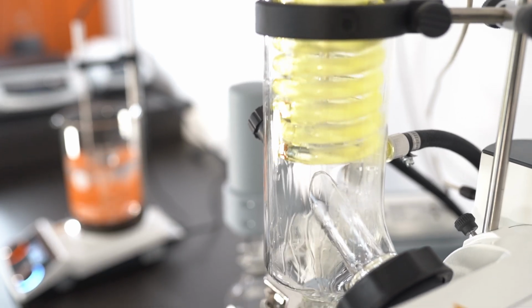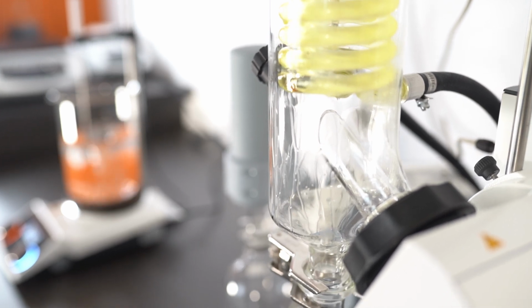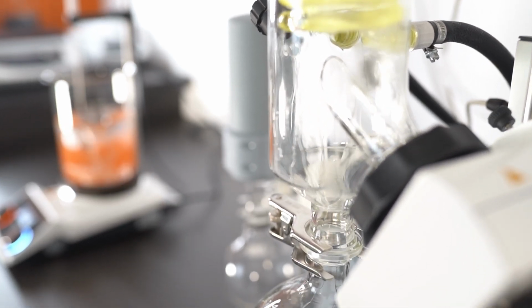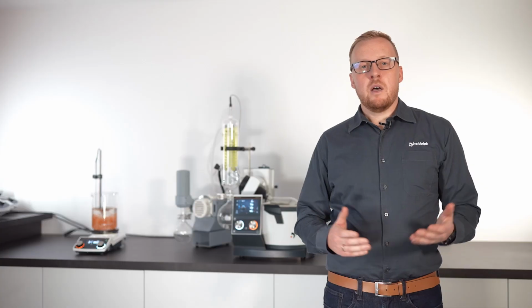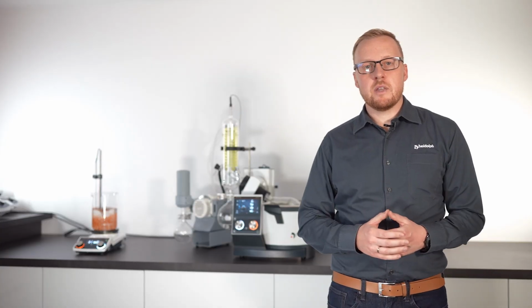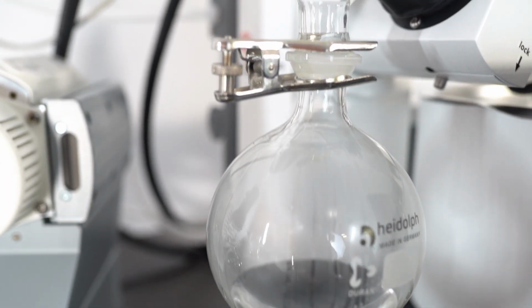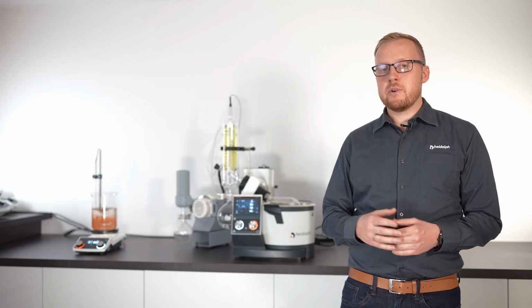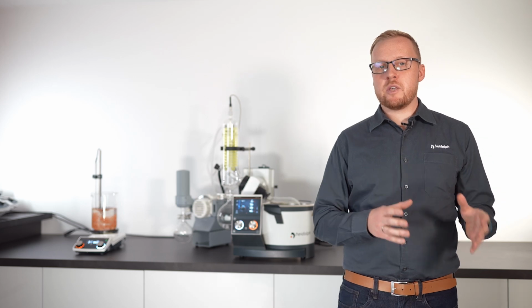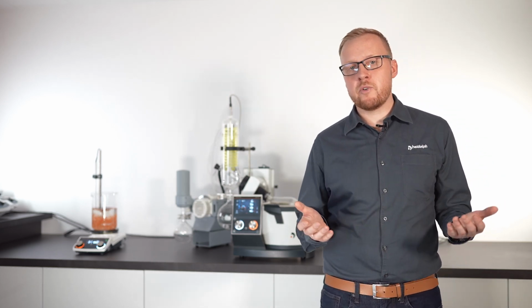As soon as the first rising vapor increases the temperature at our point of measurement, the system reacts and will keep the vacuum level, and with it the vapor load on our condenser, constant. After a while of constant evaporation, the residue level of our focus solvent decreases, and with it the created and rising amount of vapor. In a manual process, you would have to readjust the vacuum manually, or you accept a slow and not fully completed separation.